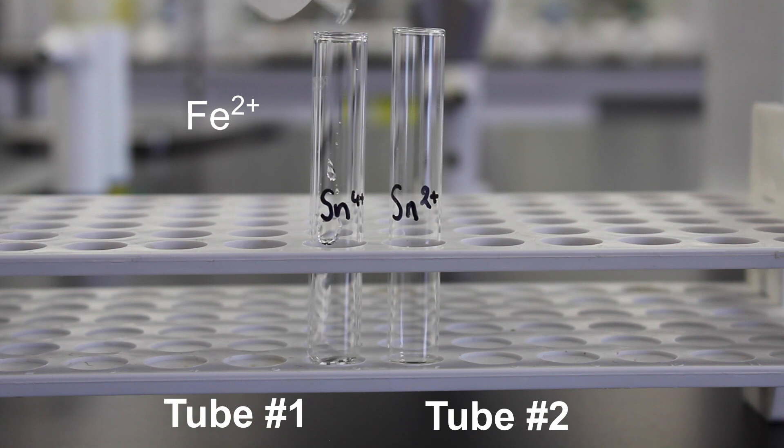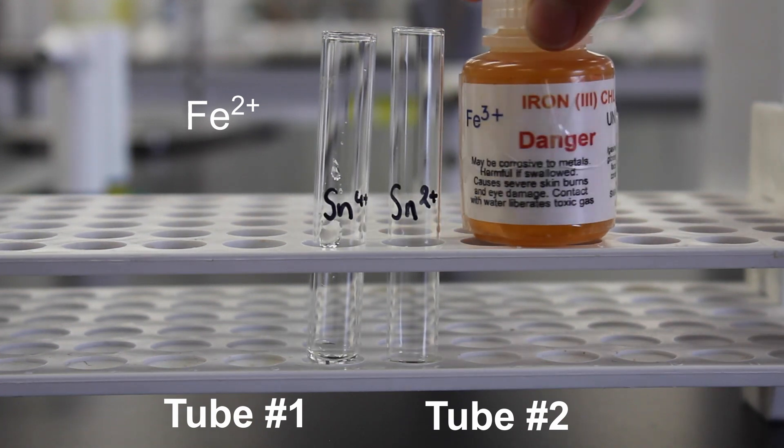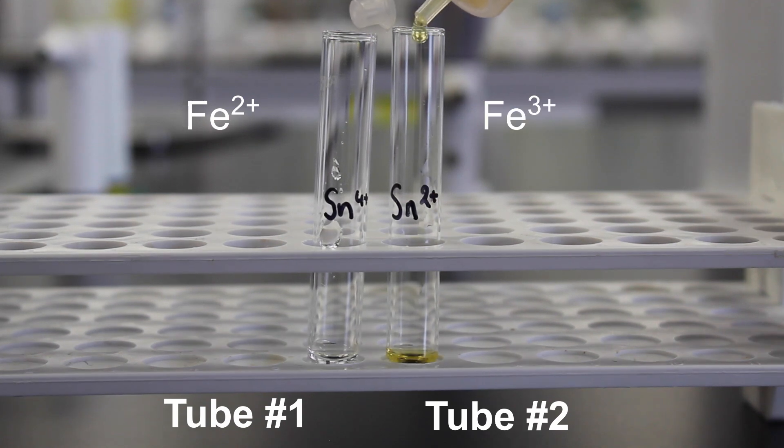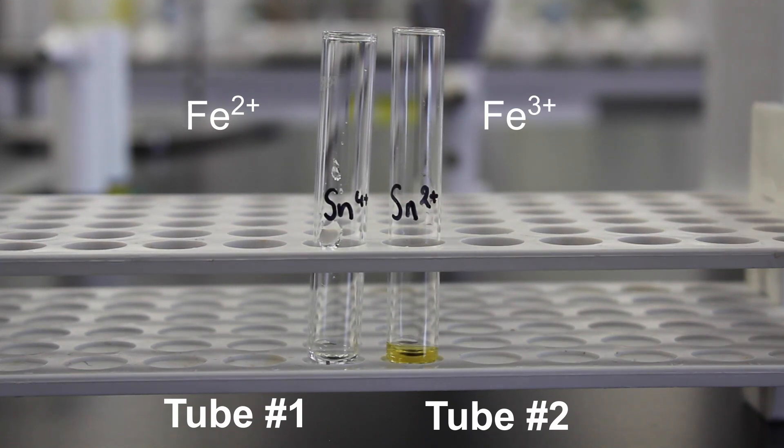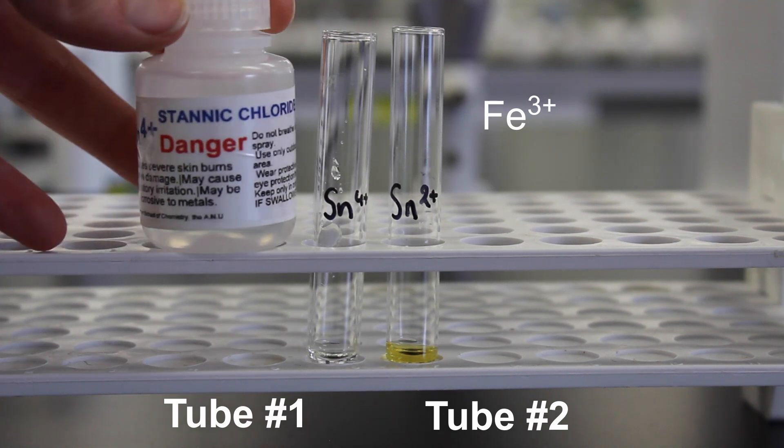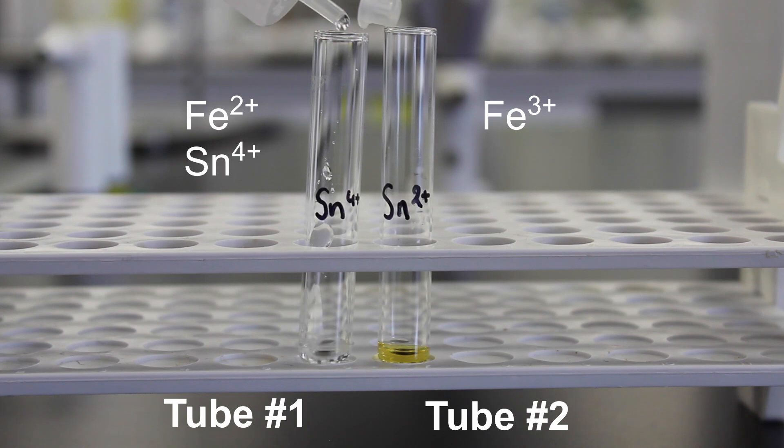Add a few drops of your iron 2+ solution to a test tube and a few drops of your iron 3+ solution to a second test tube. Now add your appropriate tin species to each respective test tube.